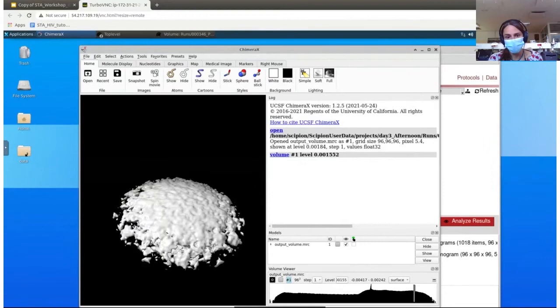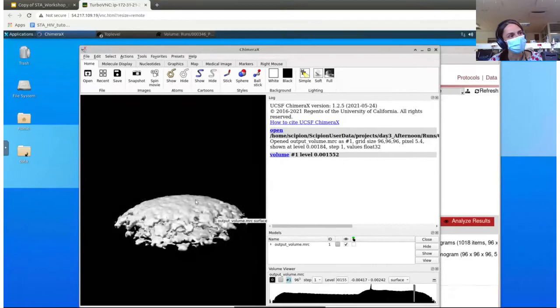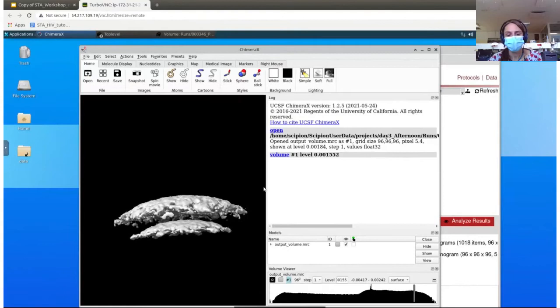Sorry, the chat goes too fast and I cannot read everything, but I think there's another question, Jorge. Yeah, regarding the shape of the structure obtained, Dimitri is pointing out that maybe it looks a little bit flat. Well, it's an initial model, Dimitri, it is what it is. It's just from averaging, not aligning anything. And the final one will be flat also. But yeah, it's not perfect.